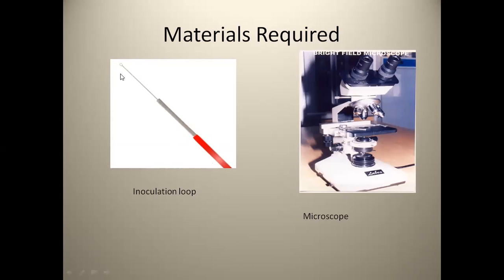It is like a wire, but if you look at a normal electrical wire, it will be insulated with a plastic or PVC, and inside there will be either aluminum or copper. But here this is made up of nichrome. That is called nichrome.